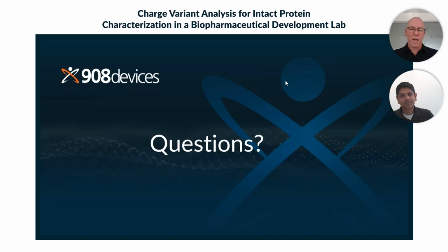So our first step at identifying something that's separated by ICE in the QC lab would be to do the ZipChip in our characterization lab. Yeah, and also, like you showed in your presentation, you can go one layer down from intact, which is subunit analysis, and maybe probe the molecule further over there, right?